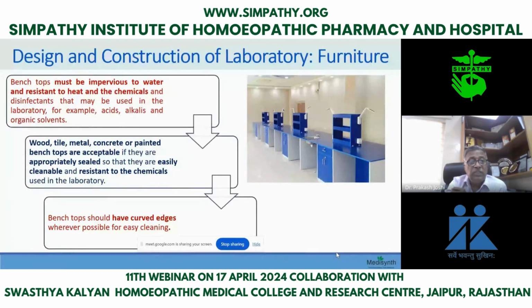Now, bench tops, as I told you, must be impervious to water, resistant to heat and chemicals, and disinfectants that may be used in the laboratory. Usually you have seen on the right hand side, these are the laboratory patterns, and that is why, as I told you earlier, bench tops should have curved edges. The purpose is just that you should not hurt your fingers or hands, basically.